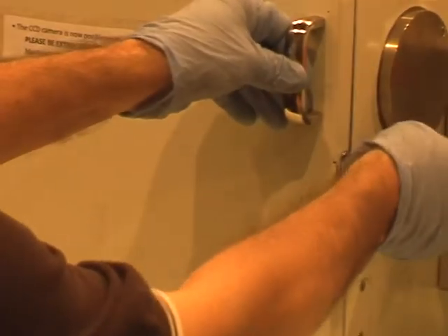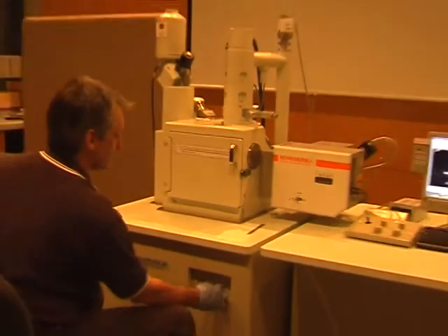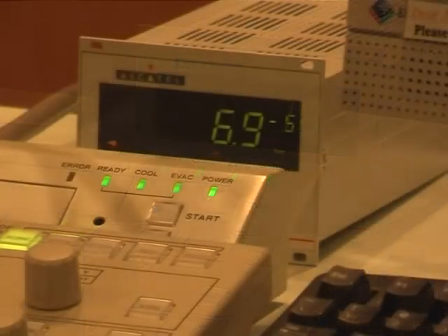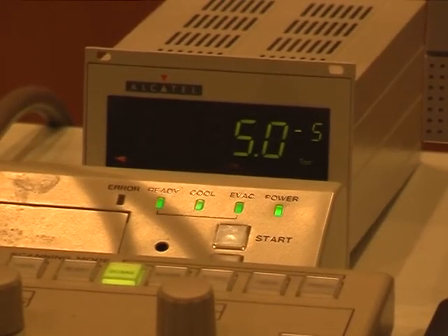Close your chamber door carefully and secure the latch. Press the Evacuate button. Wait until the vacuum reaches 5×10⁻⁵ Torr before turning on the HT — this can take at least 5 minutes.